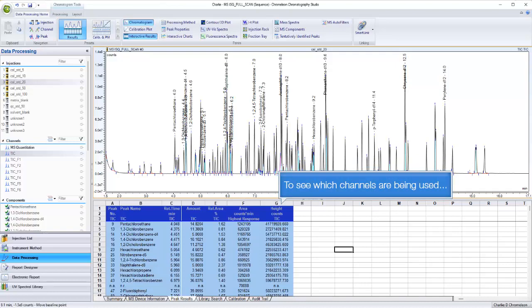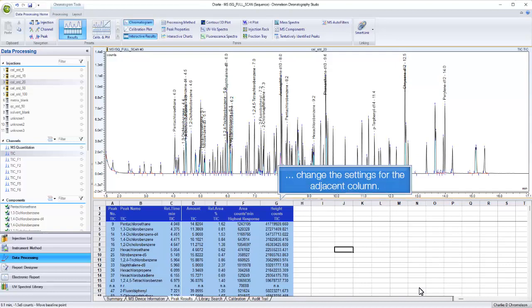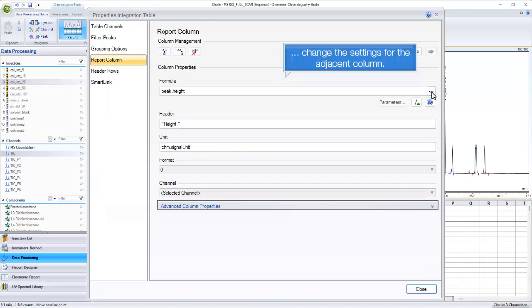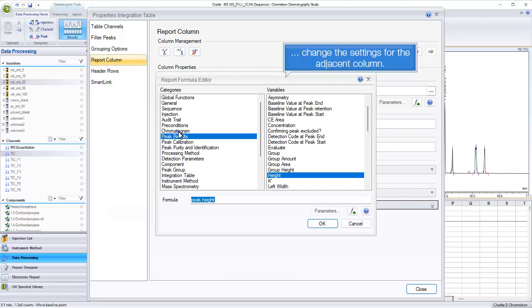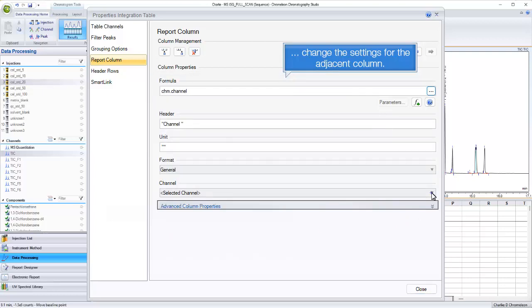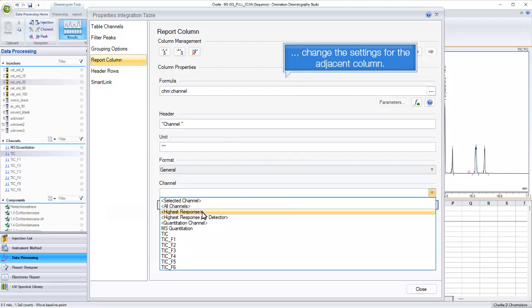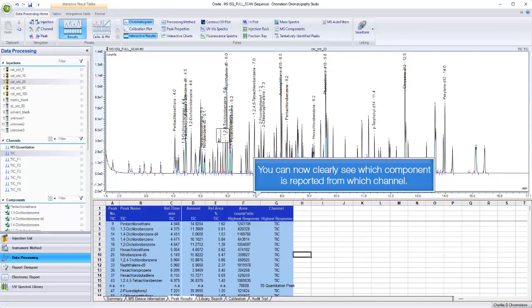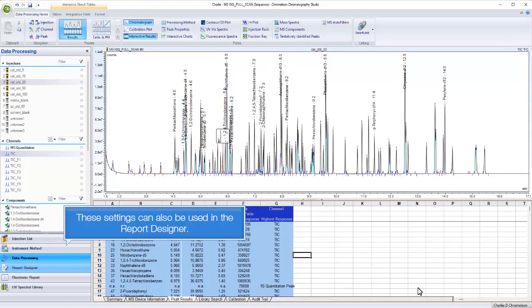To see which channels are being used, change the settings for the adjacent column. You can now clearly see which component is reported from which channel.